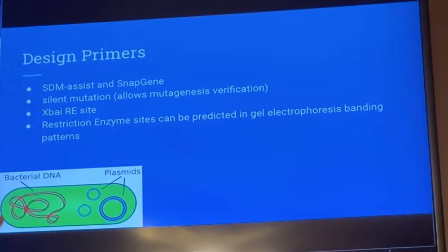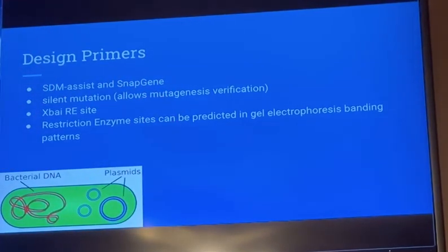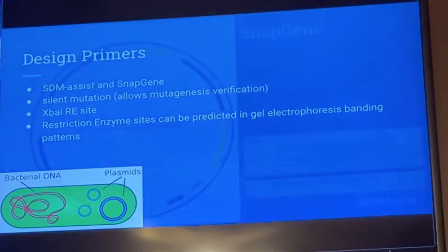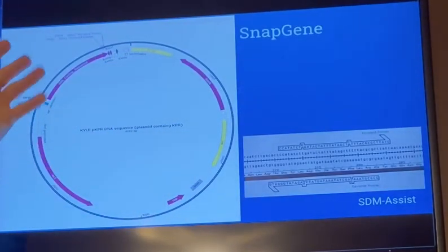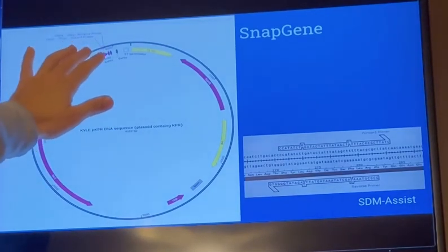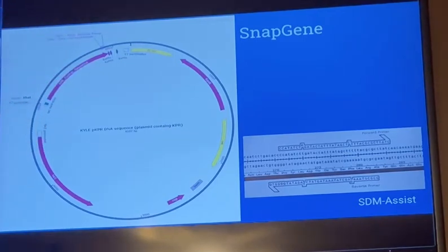Once we pick that mutation, we can use that link, upload it to SnapGene, and it'll create this plasmid on a close-up level so we can identify what we want. As you see here, we have our reverse primer and forward primer. These are the primers that are going to create the exact mutation that we are looking for.